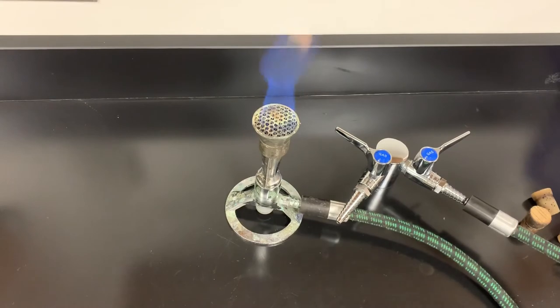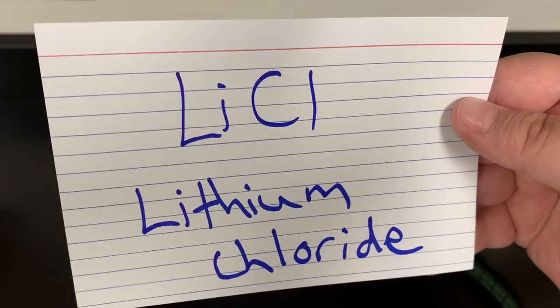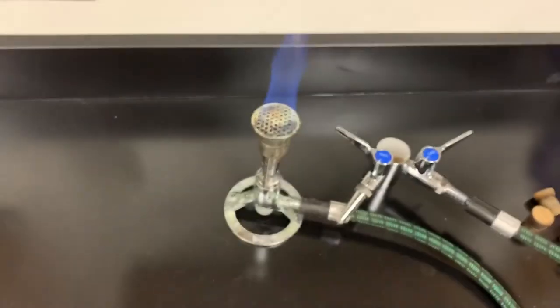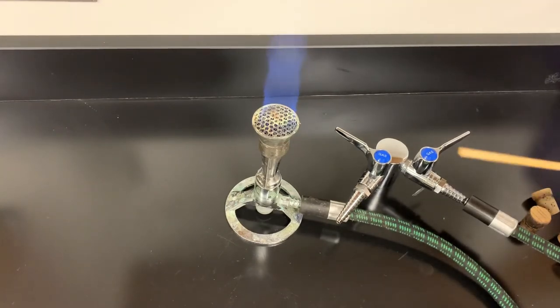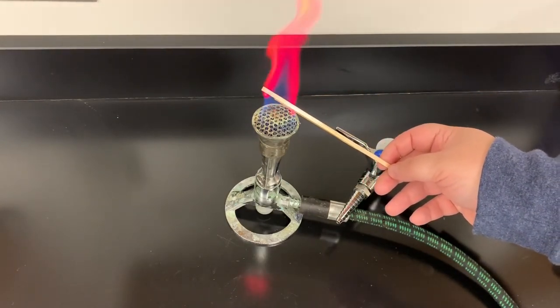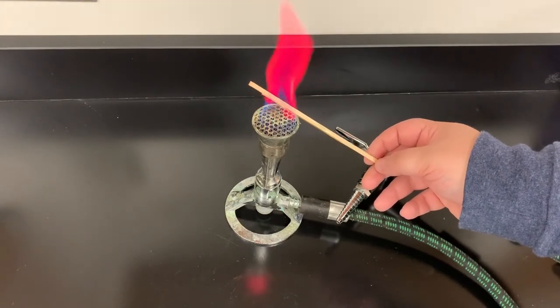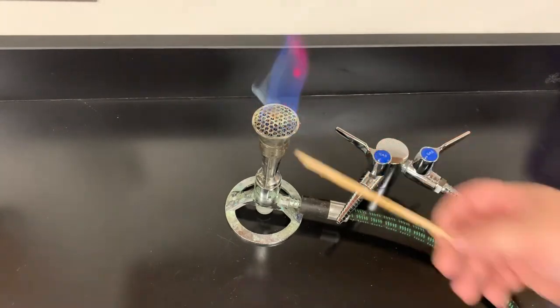Our final compound is LiCl, which is lithium chloride. Lithium gives this lovely fuchsia color — it's got a little bit of an orange, a reddish-orange color to it. And that is lithium.